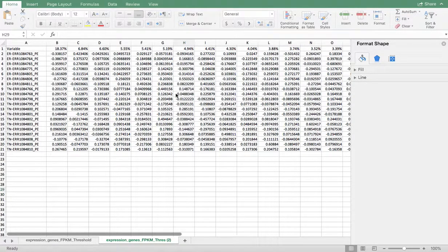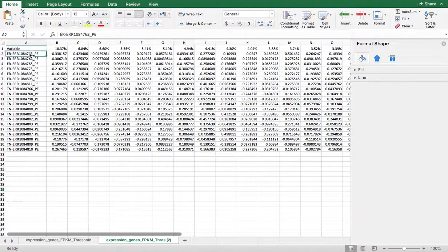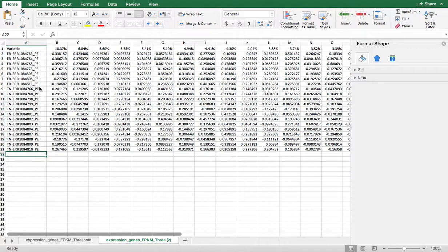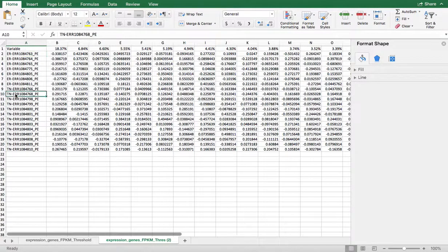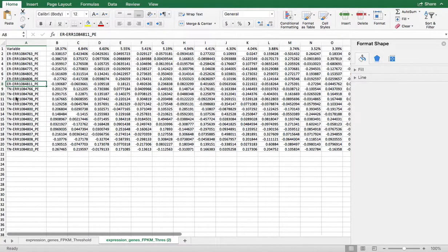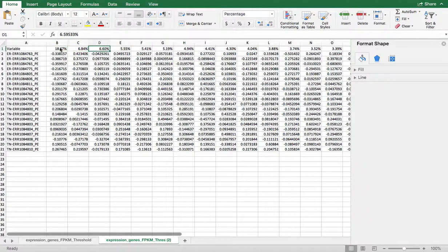Your table looks something like this. You've got samples right here. These are the names of samples. You can see here annotations. This is ER and TN, triple negative and ER positive. And here you've got the PCs.